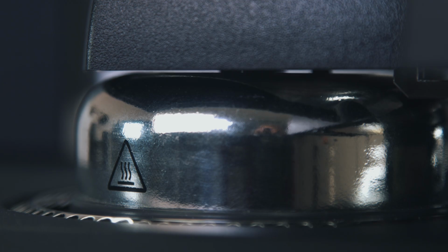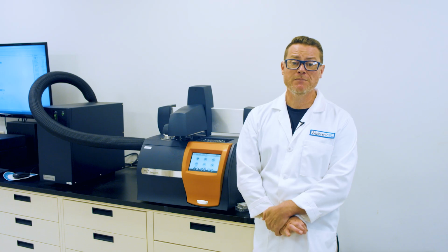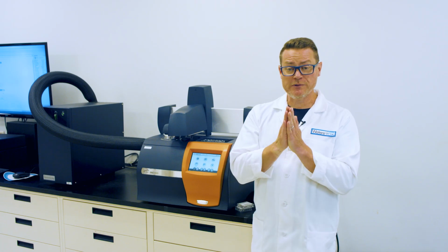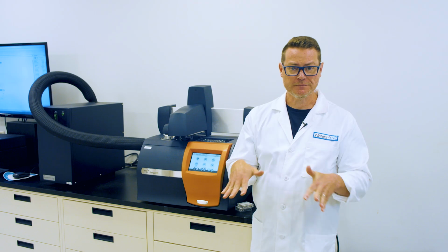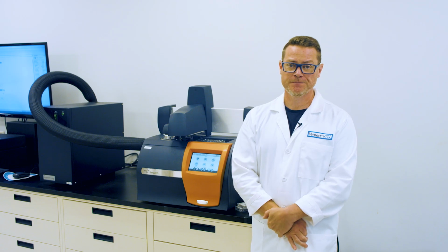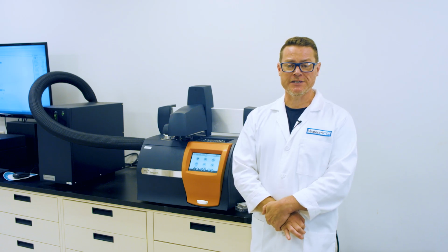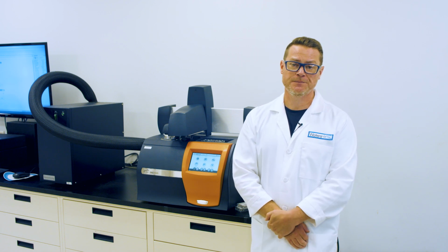Before the melting temperature, a crystalline material will increase in temperature as power is supplied to it. However, when melting starts, the sample will instead use the power being supplied to break the bonds holding the molecules in a crystal lattice. Hence, while melting proceeds, the sample will remain at a constant temperature while all the bonds are broken. The reference, by virtue of not doing anything, will continue to increase in temperature, and there will be a temperature difference between the sample and the reference.